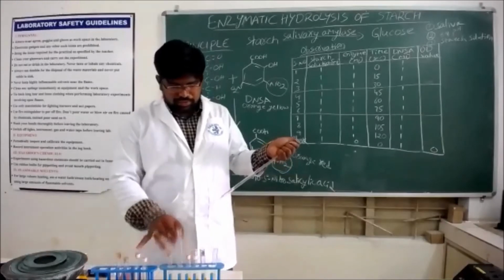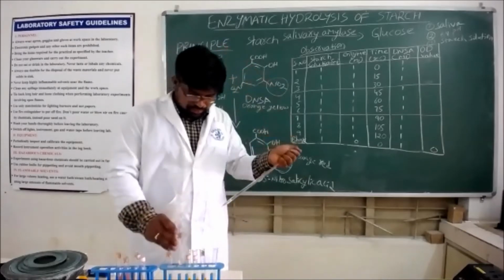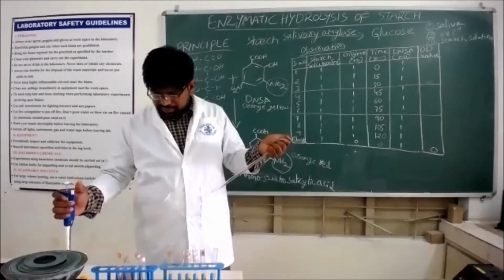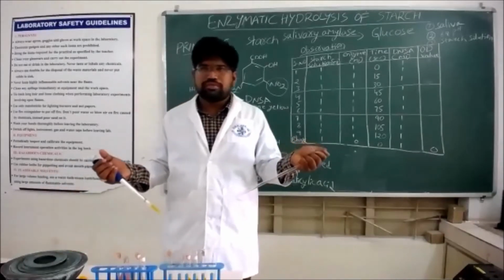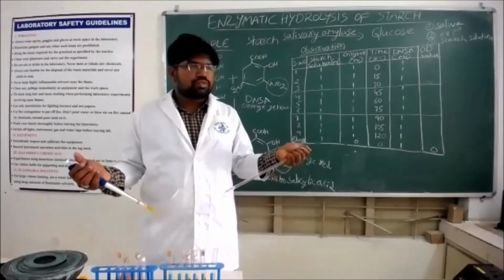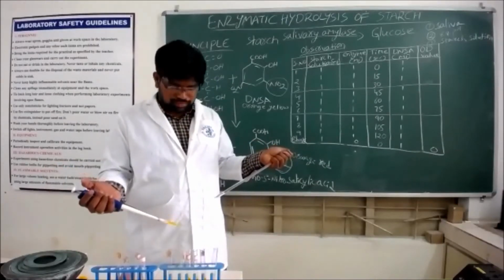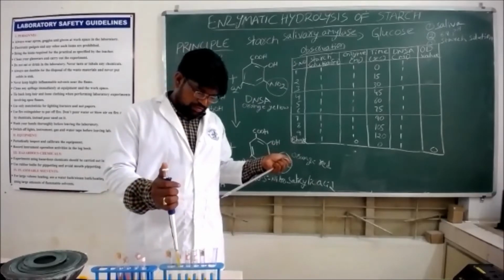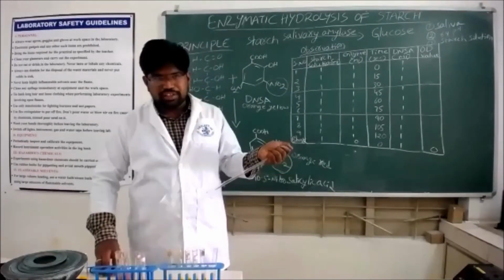So now the fourth one. Again add 1 ml of saliva. Wait 45 seconds. After 45 seconds, add DNSA.